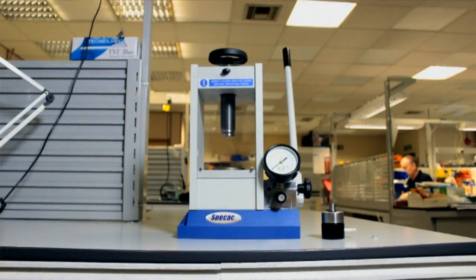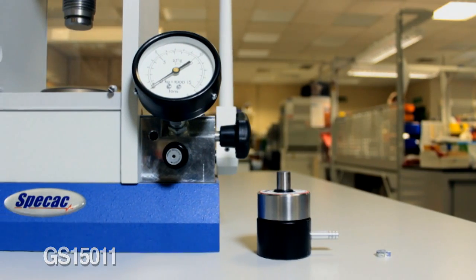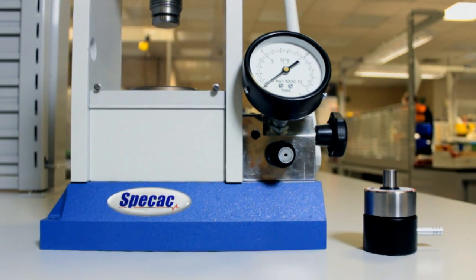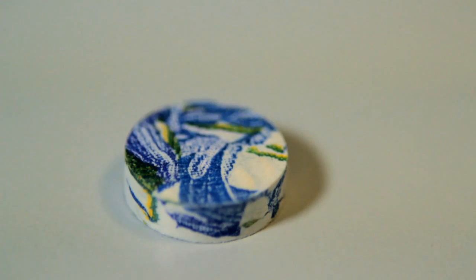Hello, my name is Clive Moss and I'm the Infrared Product Specialist for SPECAC Limited. Today I'm going to introduce the 15 tonne manual hydraulic pressing system from SPECAC. The Atlas manual hydraulic press has been designed principally for a wide variety of pressing applications, but most specifically for the production of 13mm KBr pellets that are subsequently analysed by infrared spectroscopy.